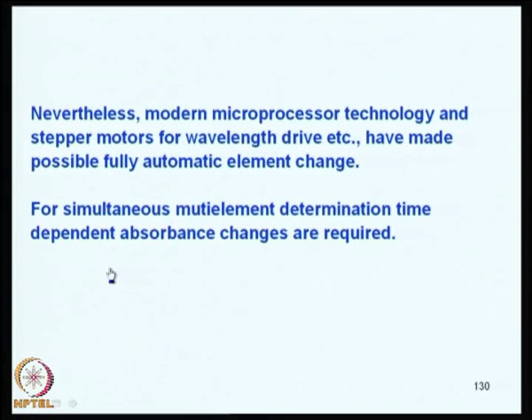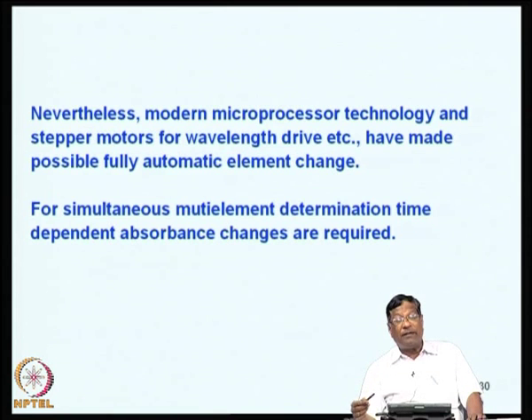So, with the computer all these things have become possible. Therefore, modern microprocessor technology uses stepper motors for wavelength drive and setting slit, etc. They are completely made automatic, and for simultaneous multi-element determination, time dependent absorbance changes are also required.